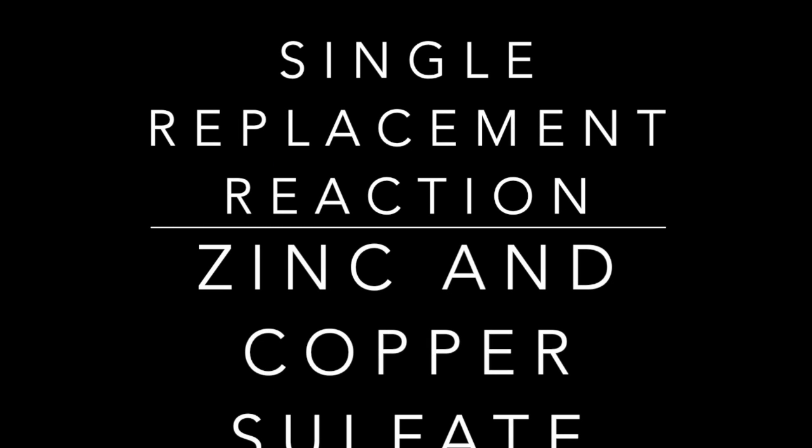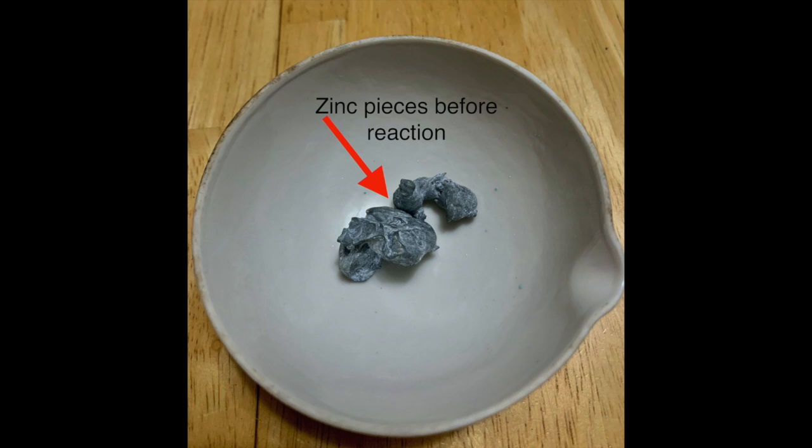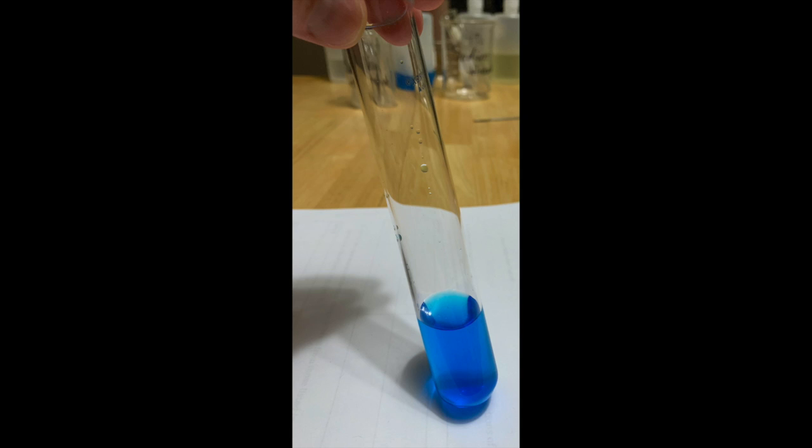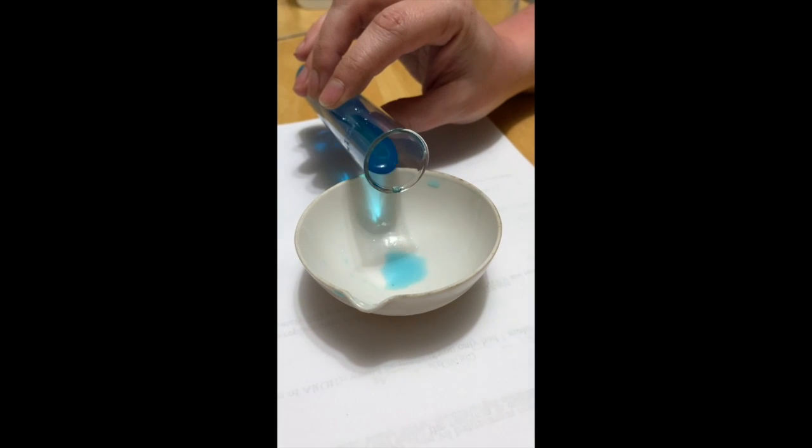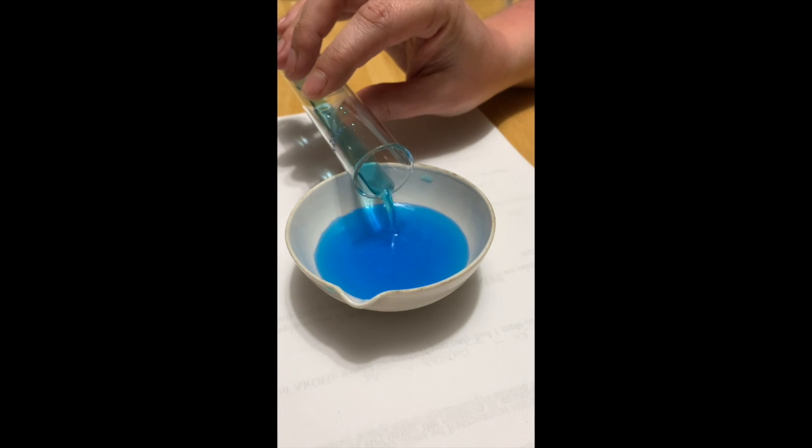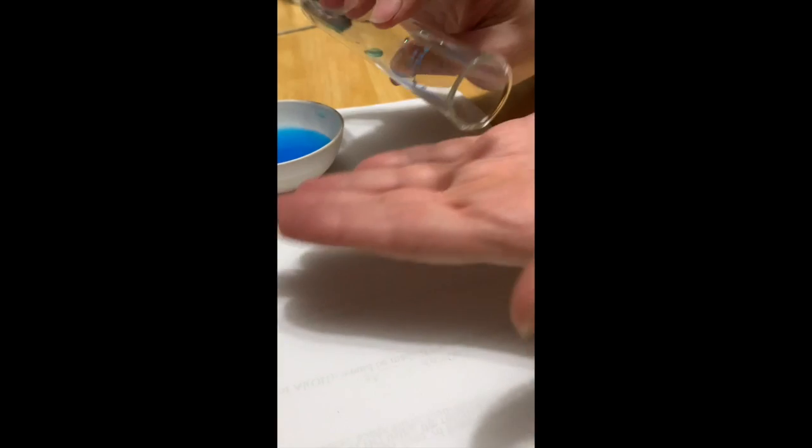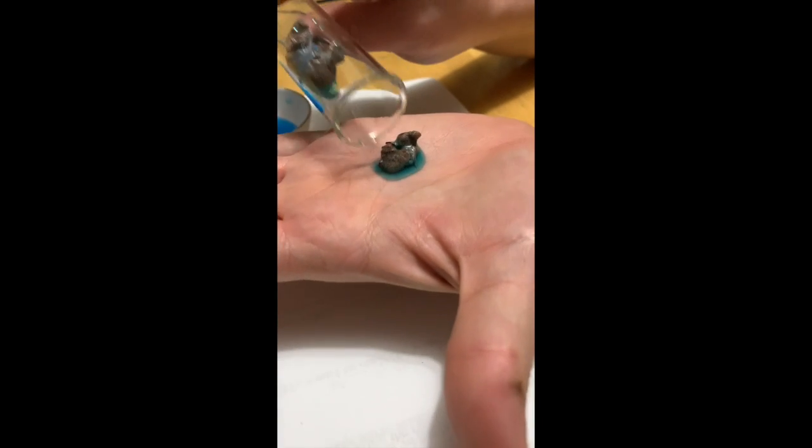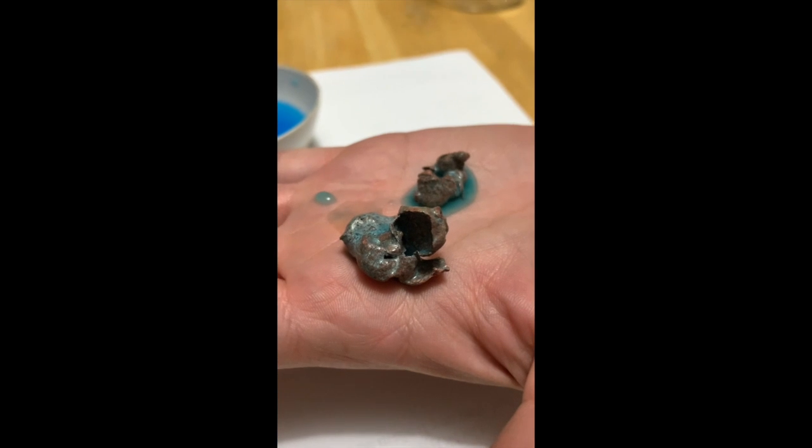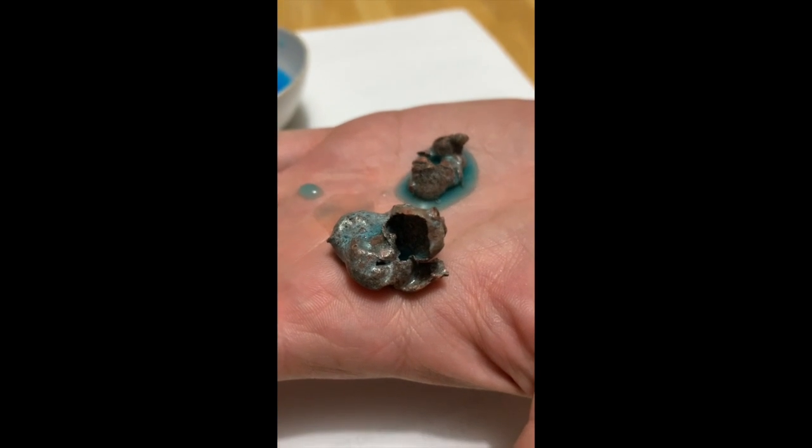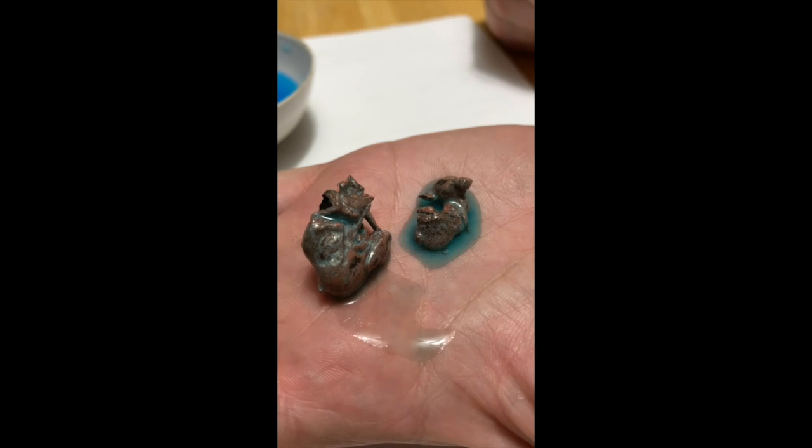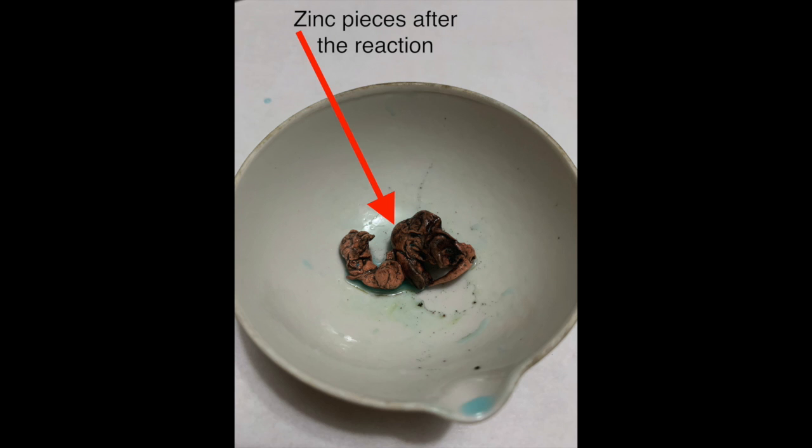Our single replacement reaction is with zinc and copper sulfate. So first we're going to take a look at the zinc. So there's what the zinc looks like before the reaction. And then the copper sulfate is the solution. So there's the copper sulfate solution. I put the zinc down in that. And then after several minutes, what you're seeing me do here is pour off that copper sulfate solution. And then I'm going to pour out the zinc pieces. So there are the zinc pieces. And then actually in the next picture, you're going to see what those zinc pieces look like after they dried off a little bit and in one of those dishes.